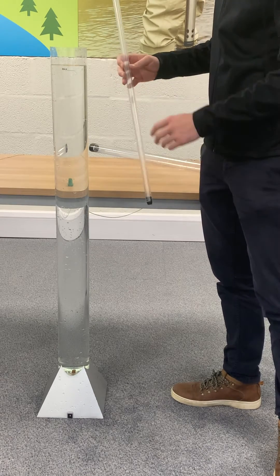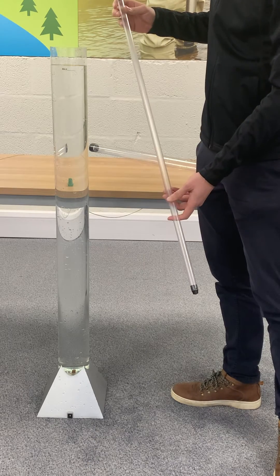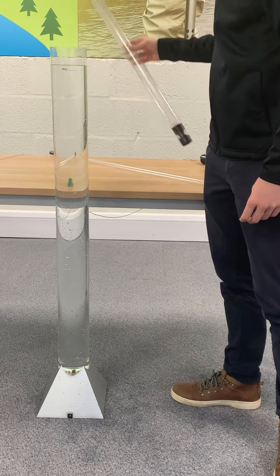Balers are available in different sizes, right down to 18 millimetres; however, the sample volume is only 75 ml compared to the 1 litre you get on a standard size baler.